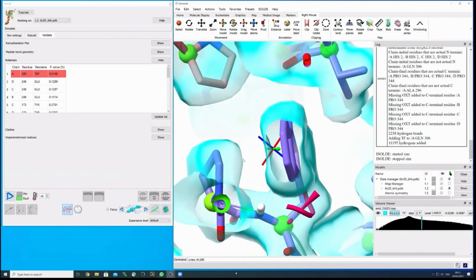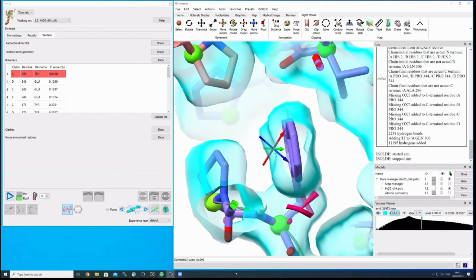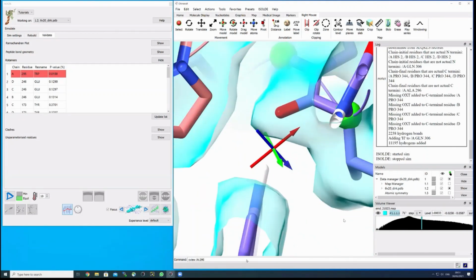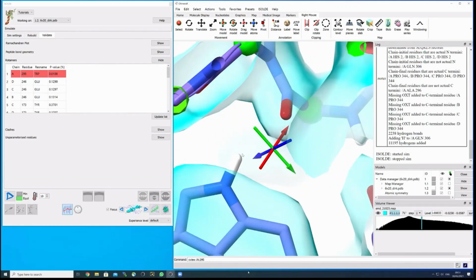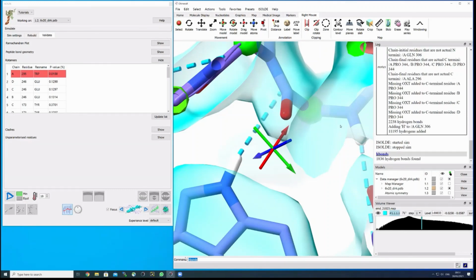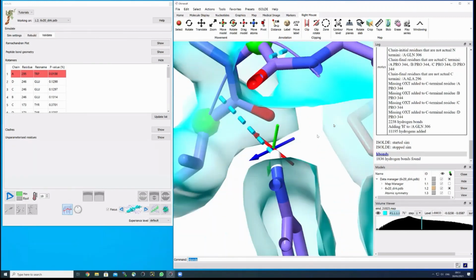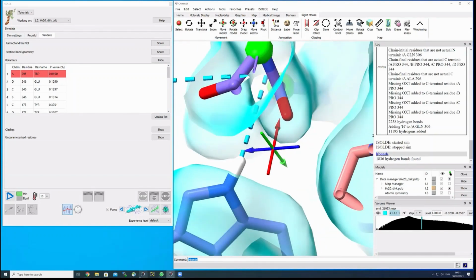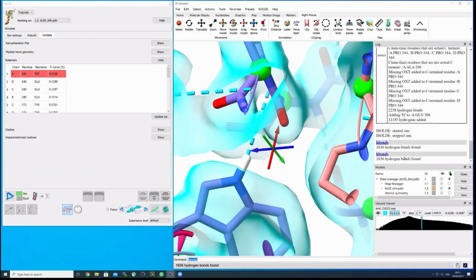In the neighborhood, you have this proline. So this is a hydrophobic packing interaction, which was satisfied before. But what is new now is this hydrogen bond that can only form now between those. You can actually display hydrogen bonds if you type H bonds as a command. Somehow this is misdisplayed here for whatever reason.